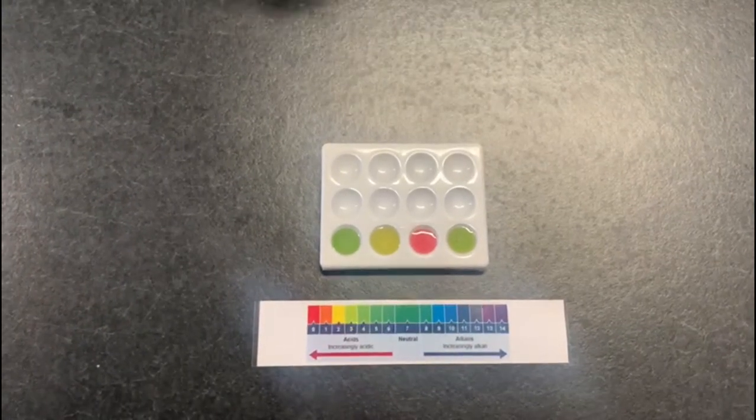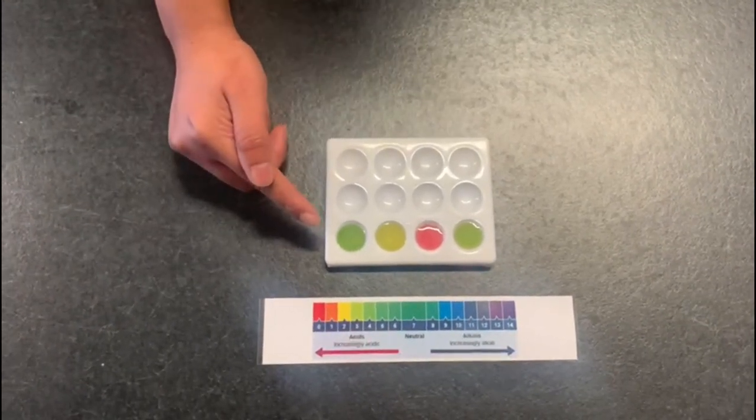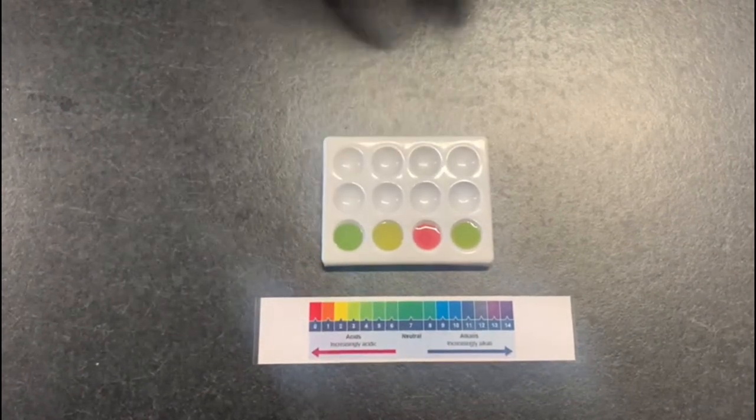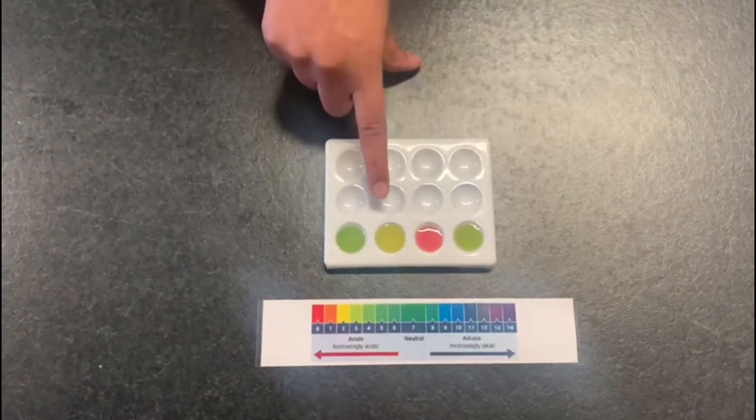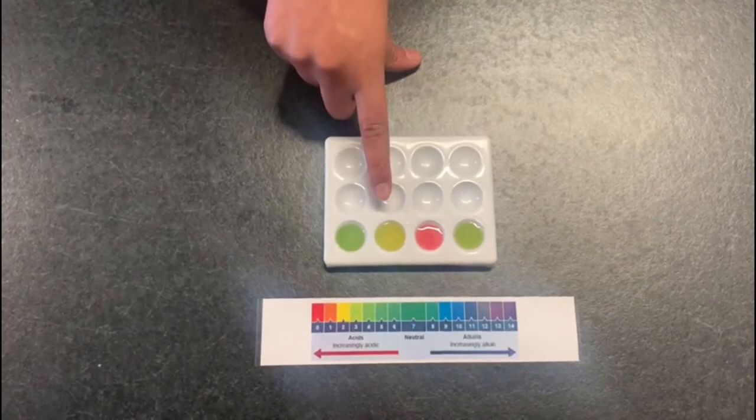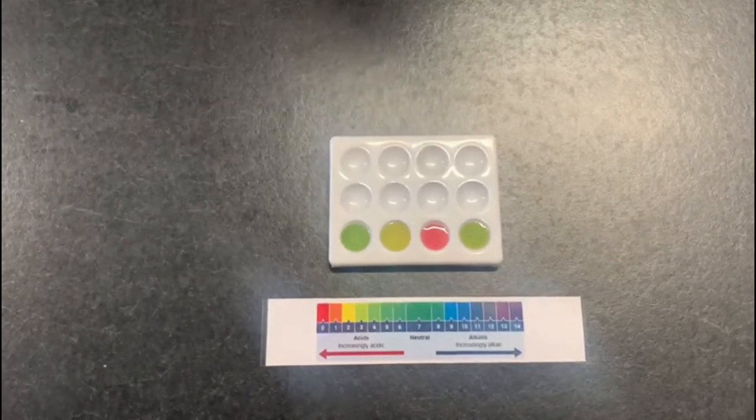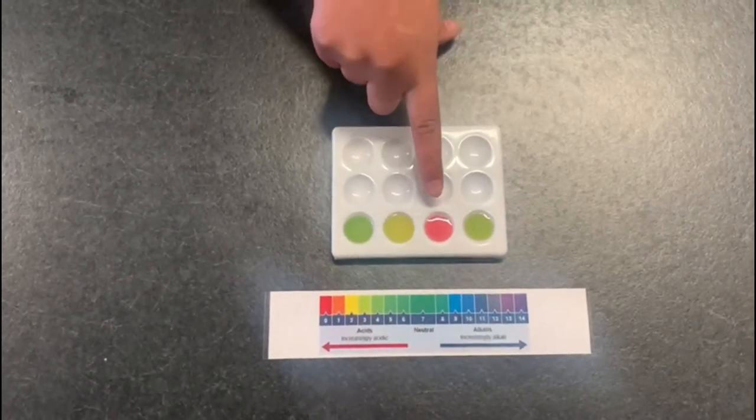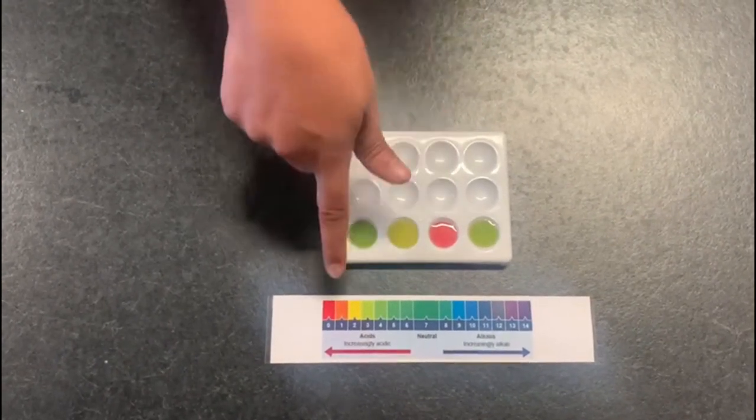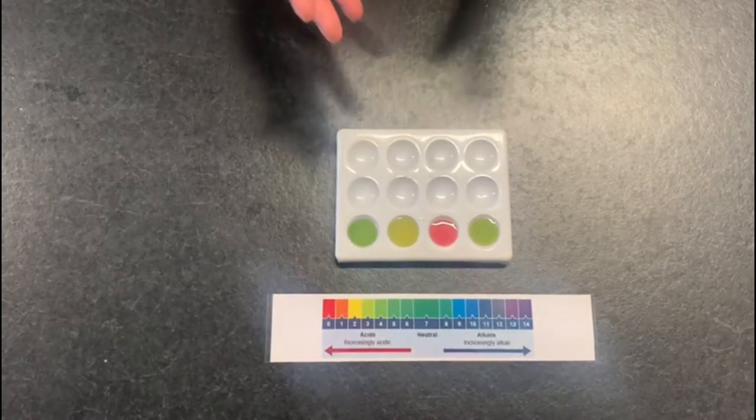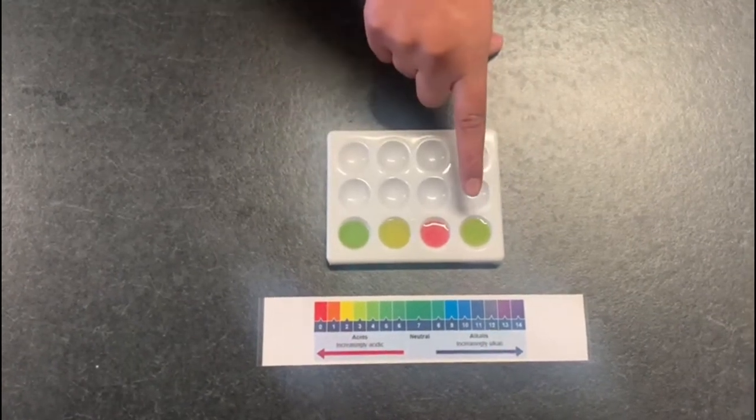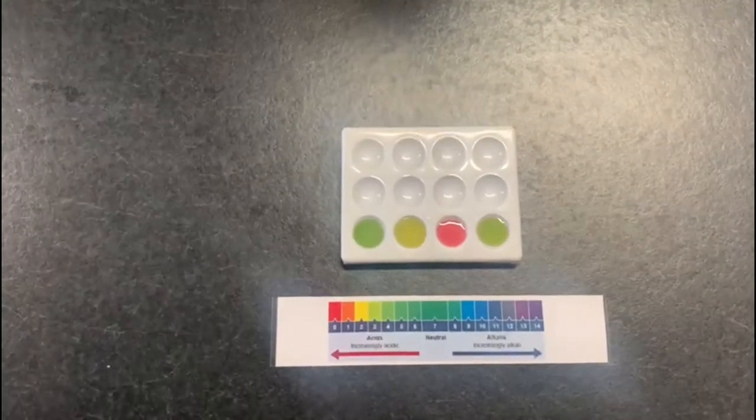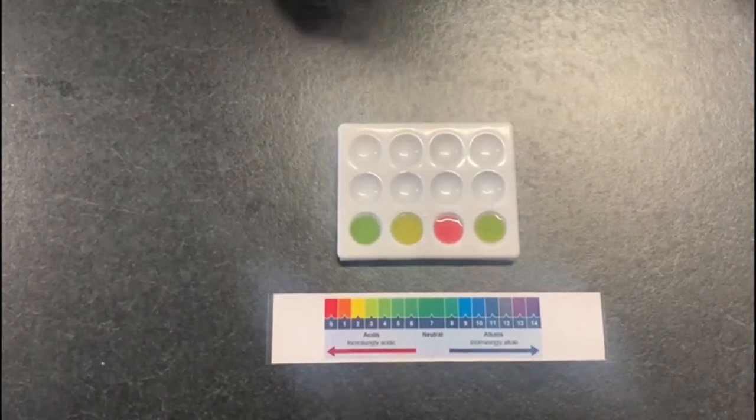I'm going to talk you through the results. Over here we have the seawater which matches up with pH 5 which is a weak acid. Then we have spring water which matches up with pH 3 which is a stronger acid. We have rain water over here which matches up with pH 0 which is the strongest acid. And lastly we have distilled water which matches up with pH 4 which is also a weak acid.